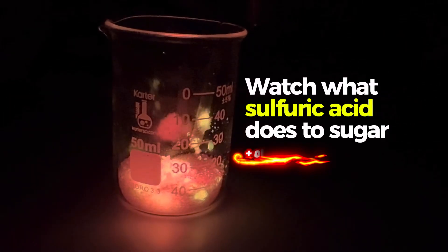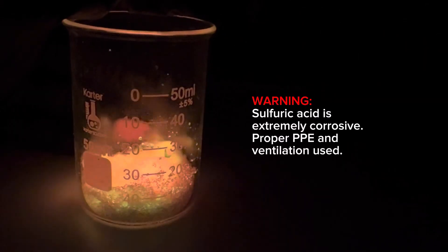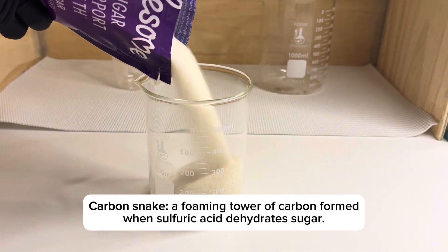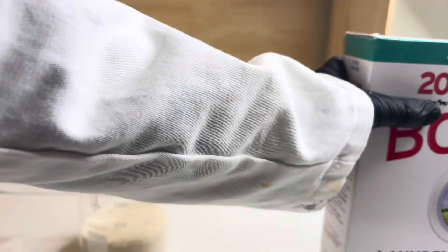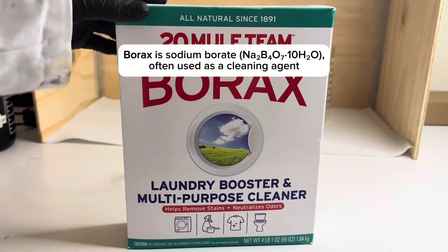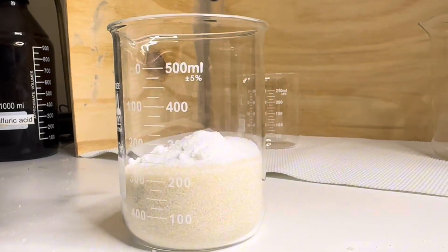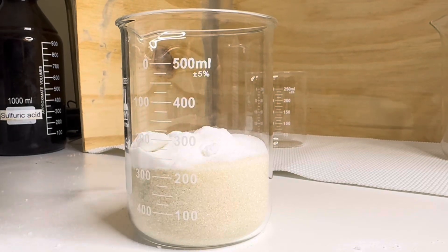Today I'm going to be mixing sulfuric acid and sugar to make carbon snakes. A carbon snake is an eruption of black carbon from mixing acid and sugar. For a twist, I'm adding borax — sodium borate — which should be mostly inert during the acid-sugar reaction.